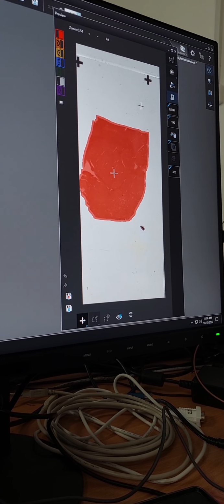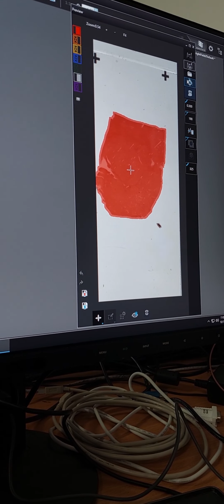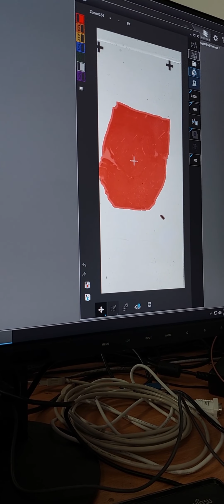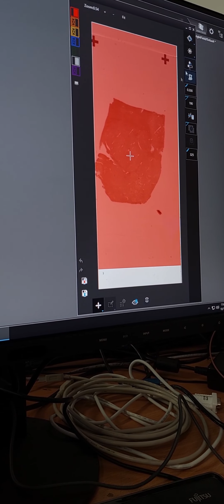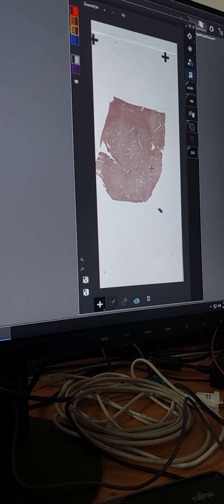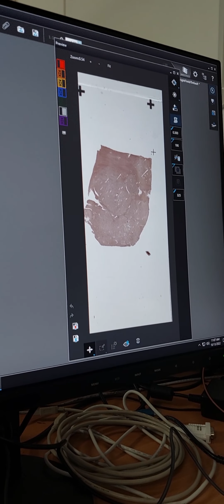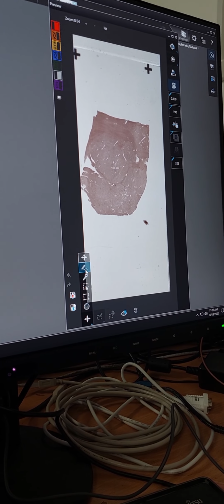If you are still not happy with this and want to do it manually, then you have to change to manual sample selection. It is very important: if you leave the mouse for a second on every kind of icon, you will know what it is doing. So manual sample selection is the following. I will clean the scan map. Now you don't have thresholding. Of course when I adjust the threshold, it goes back to thresholding, but with manual sampling you are free to draw any kind of scanned areas, and for that we have a simple drawing tool.